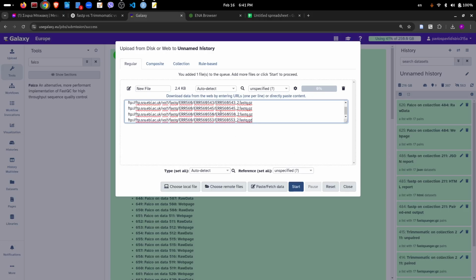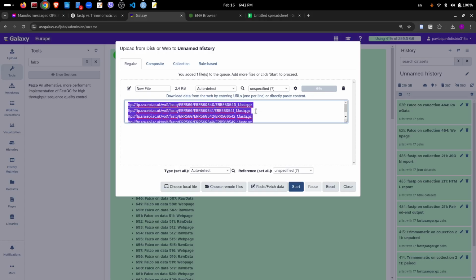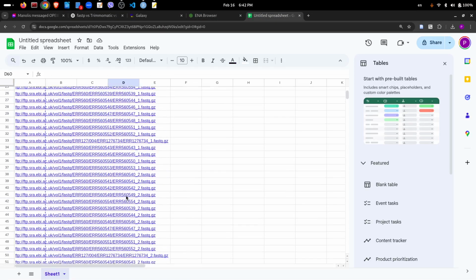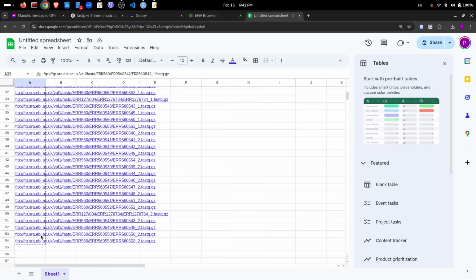Since I have done it already, I will just demonstrate it for a few. What I can do probably is delete all this and just upload the pairs for a couple of files. So I go again to Excel. Just take the first two and I will delete all the rest.